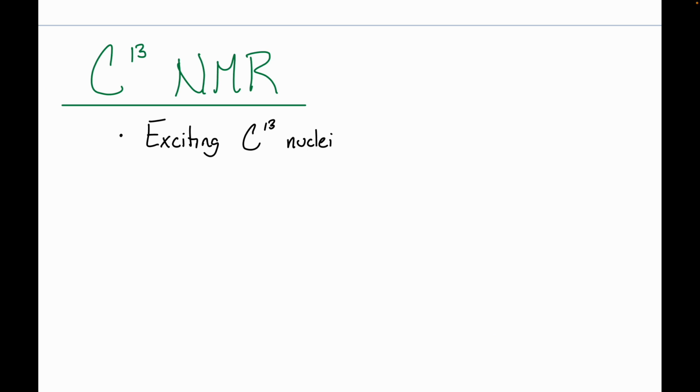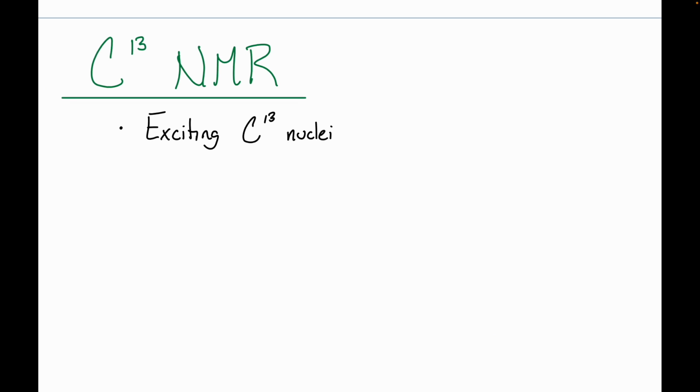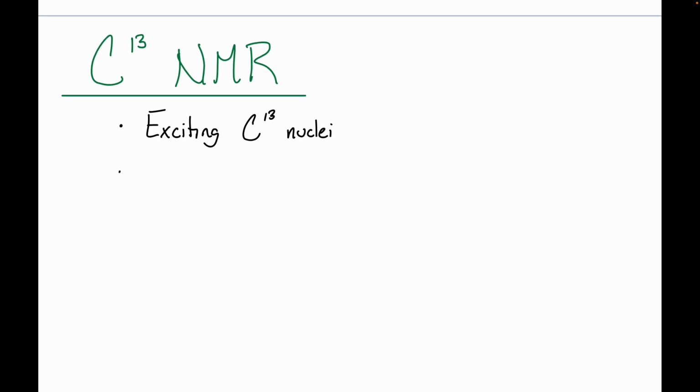One way to get around that is that you can buy isotopically pure carbon-13 and make your molecule with that. And it costs about a gajillion dollars to do it. So again, we're limited by practicality here. But nonetheless, if you can get a sample concentration pretty high, which works great for, say, a pure liquid like an alcohol, you'll be exciting these carbon-13 nuclei. So C13 is very rare, and we need lots of sample, a high concentration of our sample.